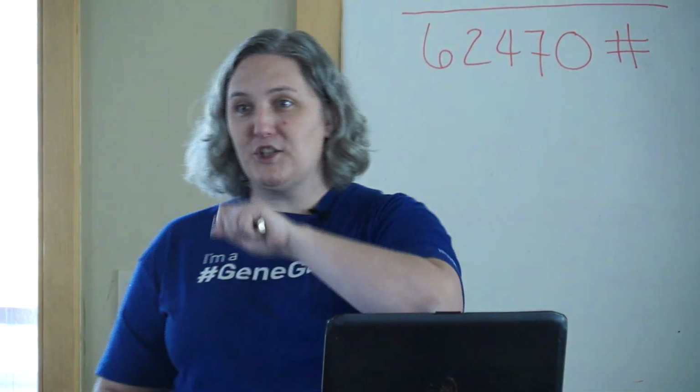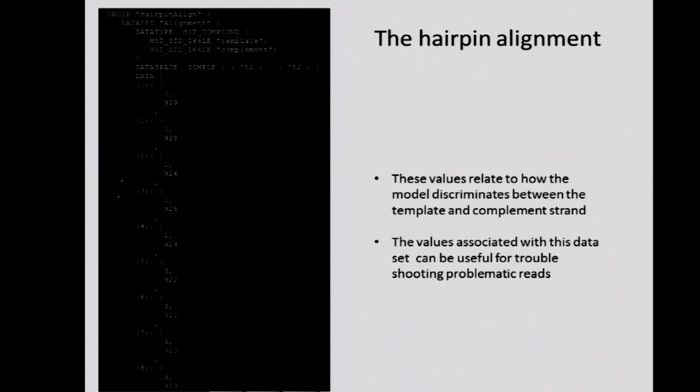Okay. Back to the question about the hairpin. The hairpin alignment is just one of several fields that associates the hairpin. There are characteristic bases, abasic sites, and certain sequences all associated with the hairpin. When the system goes, hey, I see these characteristic voltage patterns, that must be the hairpin, okay? And those are all recorded also in that FAST5 data structure. When it identifies those, then it switches to the complement model for predicting the base set.